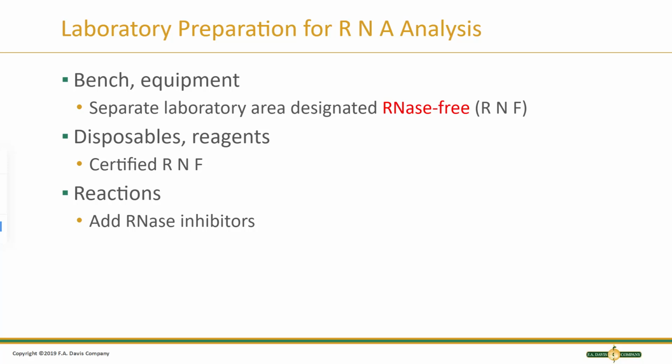Laboratory preparation for RNA analysis. For the bench and equipment, you have to use a separate laboratory area that's designated as RNase-free. RNases are everywhere. They're contaminating in the environment. They're all over the place. So if we want to do any work with RNA, we would conduct that work in a separate laboratory area. Disposables or reagents should be certified RNase-free. In reactions, add RNase inhibitors.